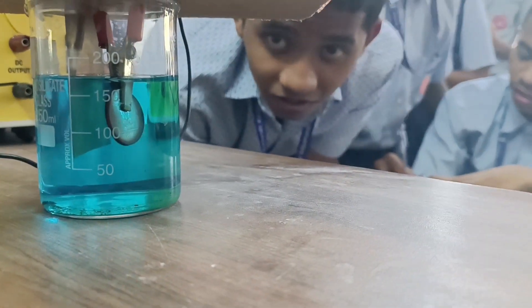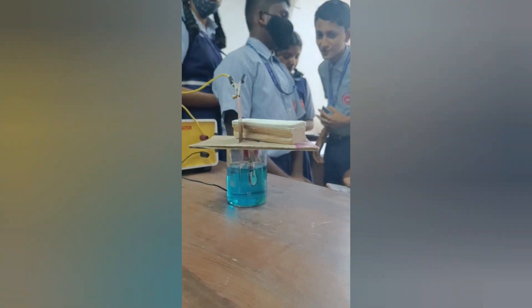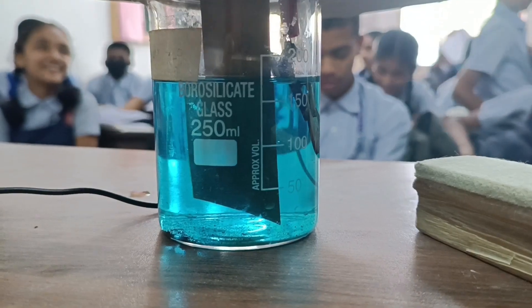it can dissociate into copper plus ions and sulphate minus ions. The copper positive ions move towards the negative terminal of the electrode, that is, they start moving towards the cathode. In this way, it forms a layer of copper metal over the coin.